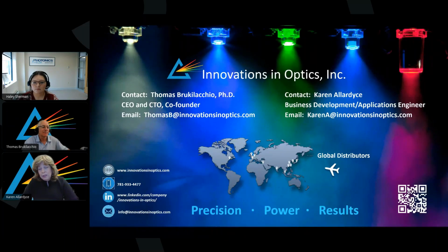Longer lifetime, certainly. So whichever way you go, whichever technology you choose, it depends on the application, right? It depends on choosing the xenon versus LED. Depends on whether it's limited by peak pulse energy or overall imaging performance.